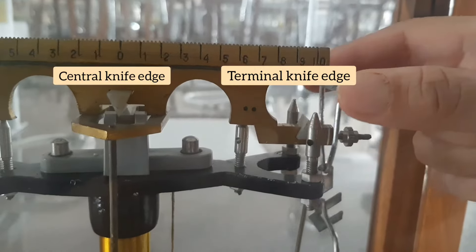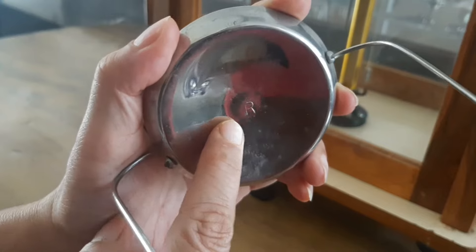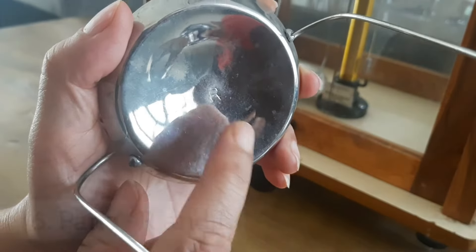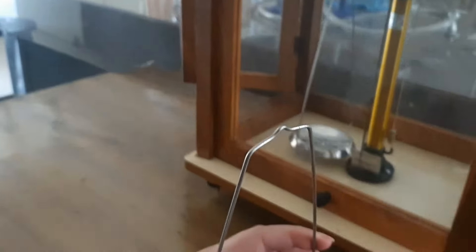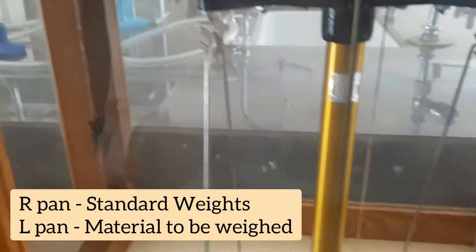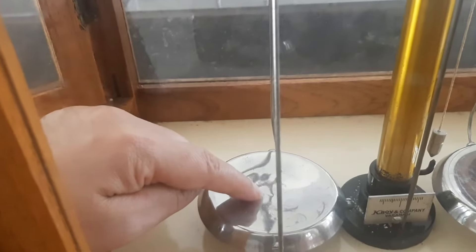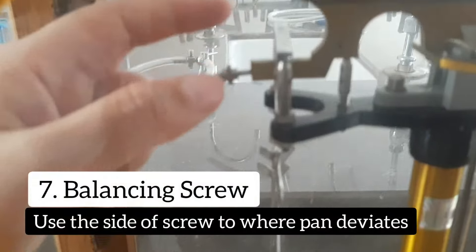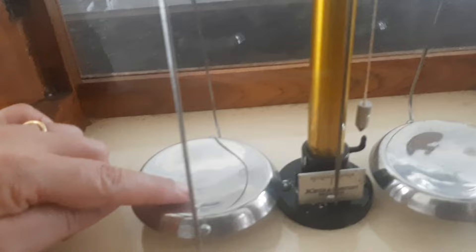This is the beam, and I am removing its various components to show you. This loop can be removed — you can read 'R' on it, which means this is the right-hand pan, on which we are going to put weights. Similarly, the other pan is marked 'L' — that is the left-hand pan, on which we place the substance to be weighed. These screws here help in small adjustments to balance both pans.